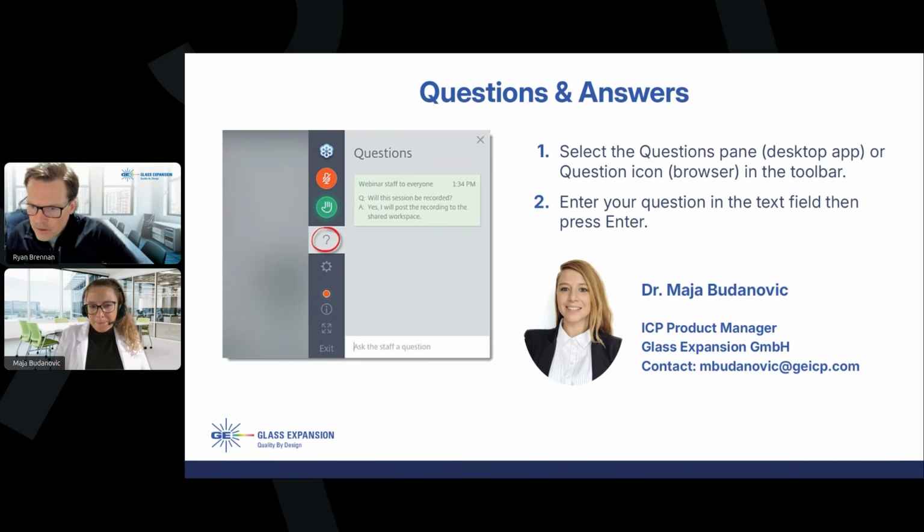Thank you, Maya. So this question came in when you were talking about spray chambers, and they specifically have asked whether room temperature will affect the results. If yes, how do you maintain the temperature? So I'm assuming this person might have some issues with the temperature control of the laboratory environment itself.